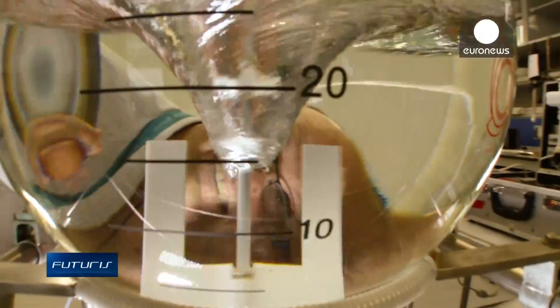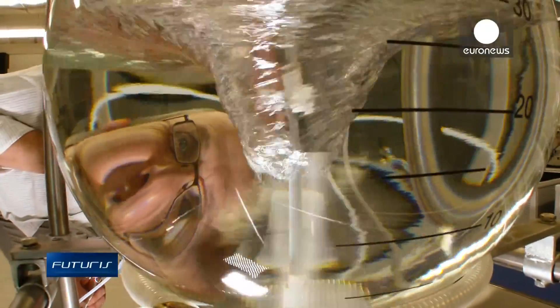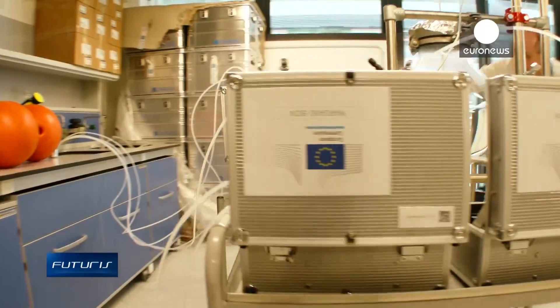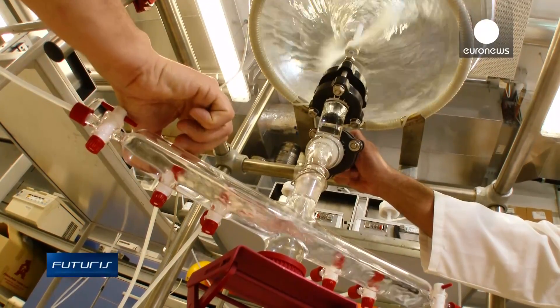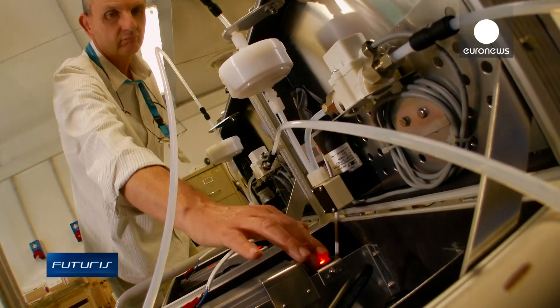The water sampling device is simple and inexpensive, and the researchers are going to make the design freely available to other specialists in this field. They say their device has already attracted a lot of professional interest.